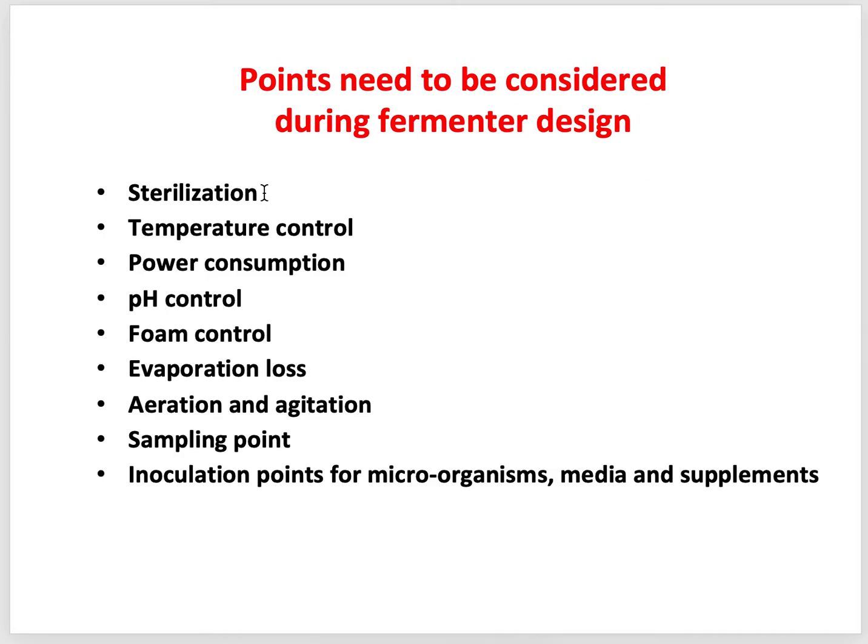We cannot do a fermentation in an unsterile container. Then temperature control and power consumption. This is important. The less power the fermenter consumes, the better, because if it consumes less power the cost will be lower, and it's always good for the industry.